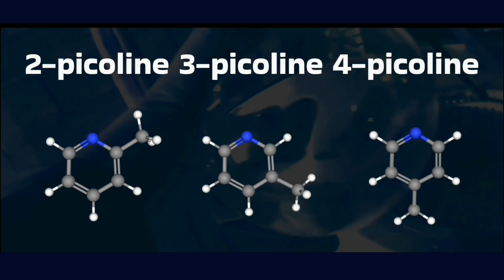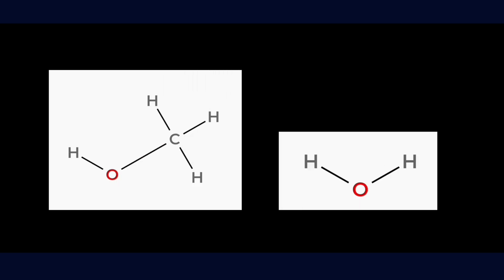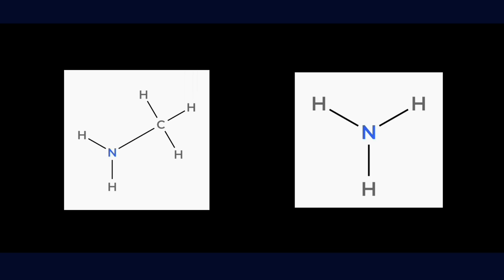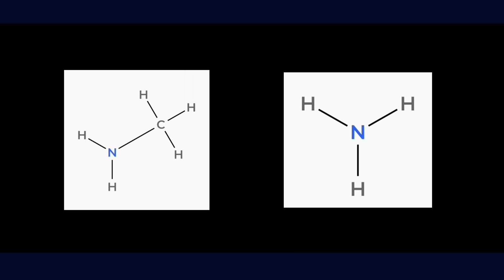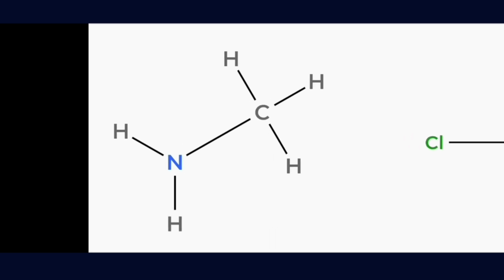But getting back to methylamine, when used in organic synthesis, it's considered more useful than ammonia because it is able to dissolve more organic molecules. Methylamine is to ammonia what methanol is to water. It is slightly less reactive than ammonia, but it forms acid salts such as the methylamine hydrochloride we are making here. Because methylamine is a gas, it's easier to handle in this form. It can easily be free-based when you want to bubble a dry stream of methylamine.